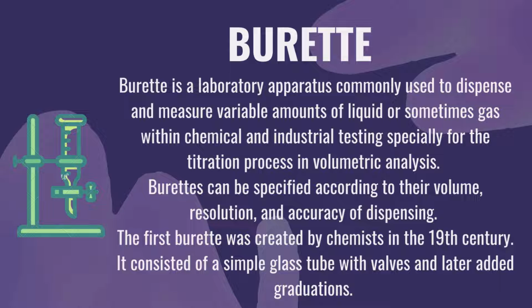My fellows, the first burette was created by chemists in the 19th century. It consisted of a simple glass tube with valves and later added graduations. This basic design is still widely used in glass burettes.